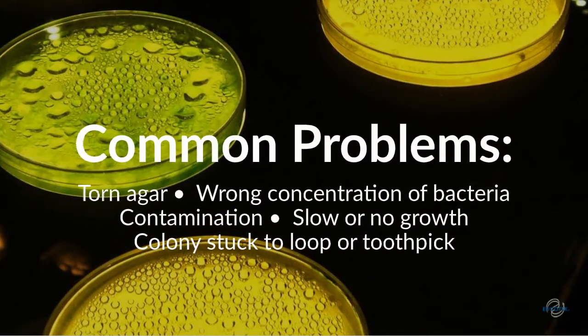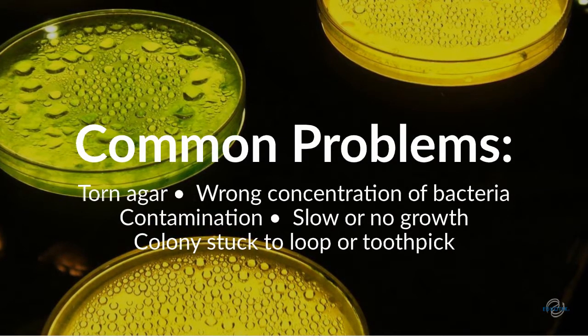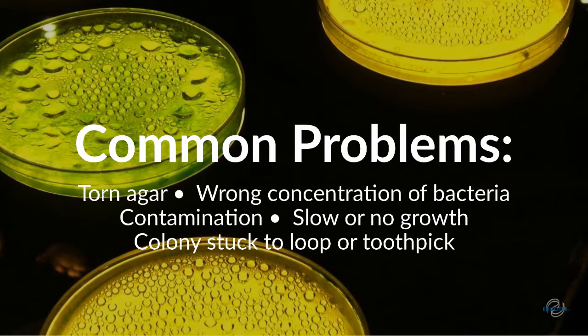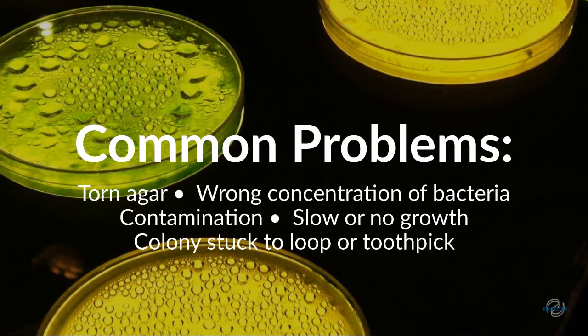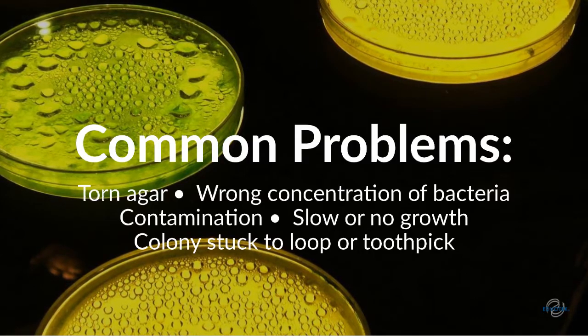Both streaking and colony collection are simple techniques, but they can be challenging. Common issues include tearing or gouging the soft agar, under or over diluting the sample during streaking, and not transferring the sticky bacteria colony during collection steps. Other potential problems are contamination and slow growth. These mistakes can jeopardize the success of your experiments.